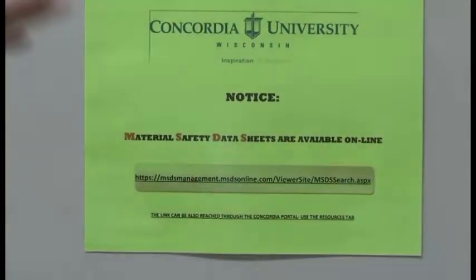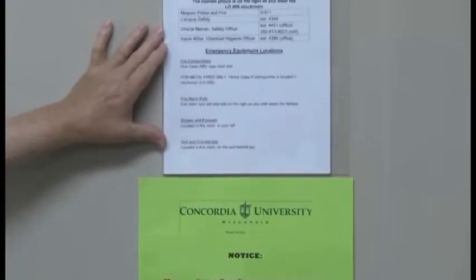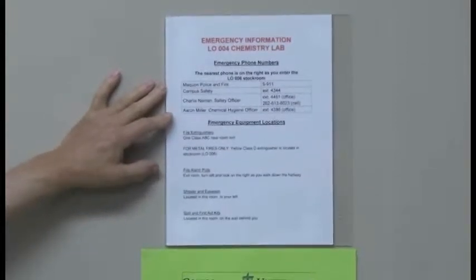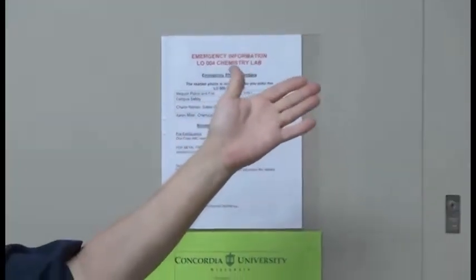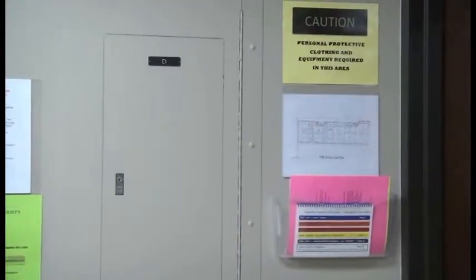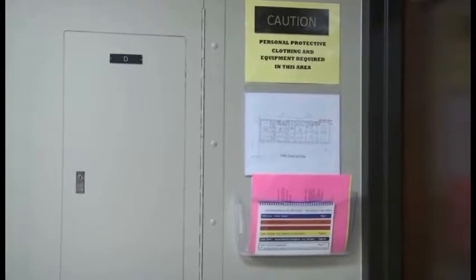Some of the other things that you see on the wall here, besides these booklets, are the emergency contact numbers, and if you can see, it's Campus Safety, myself, and then Dr. Aaron Miller that you can contact. Some of the other things on here are that when you're in this lab, you need to be wearing protective equipment: if you need hearing protection, you wear it, eye protection, aprons, as Dr. Miller talked about before when we talked about SPCC, gloves. So again, you want to be sure you're wearing that protective equipment.